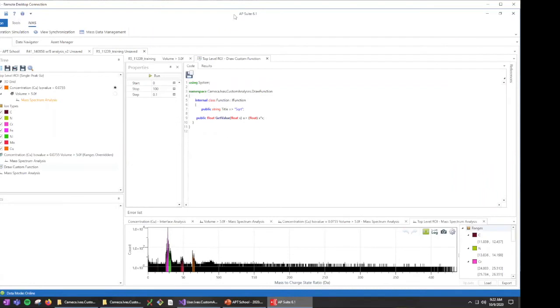Part of the reason for the annual updates is that APSuite runs the machine and is tightly coupled to it, and field service personnel don't want to be bouncing around the world installing new versions of APSuite all the time. But I think users could certainly install individual modules by themselves that don't touch the acquisition side of things. When you touch the acquisition side, then you're talking about firmware and that sort of stuff.